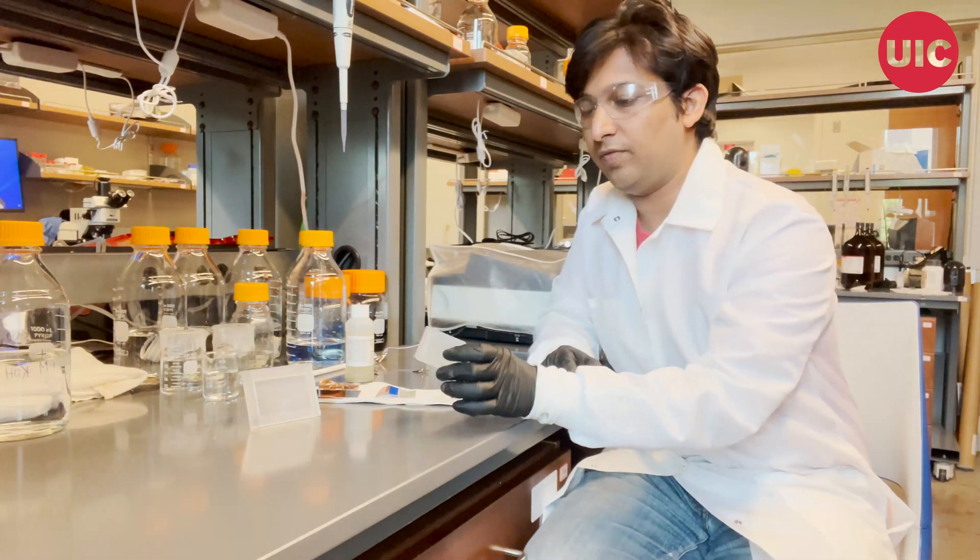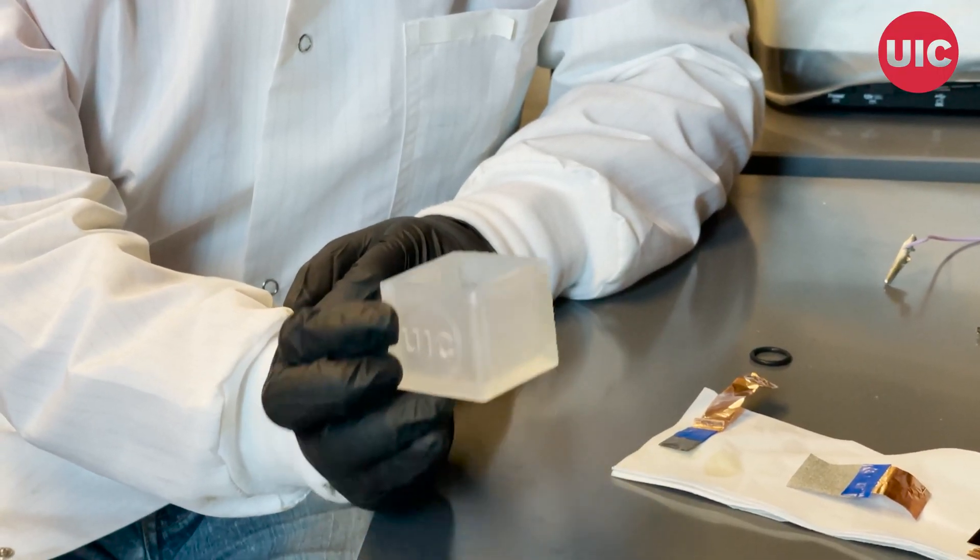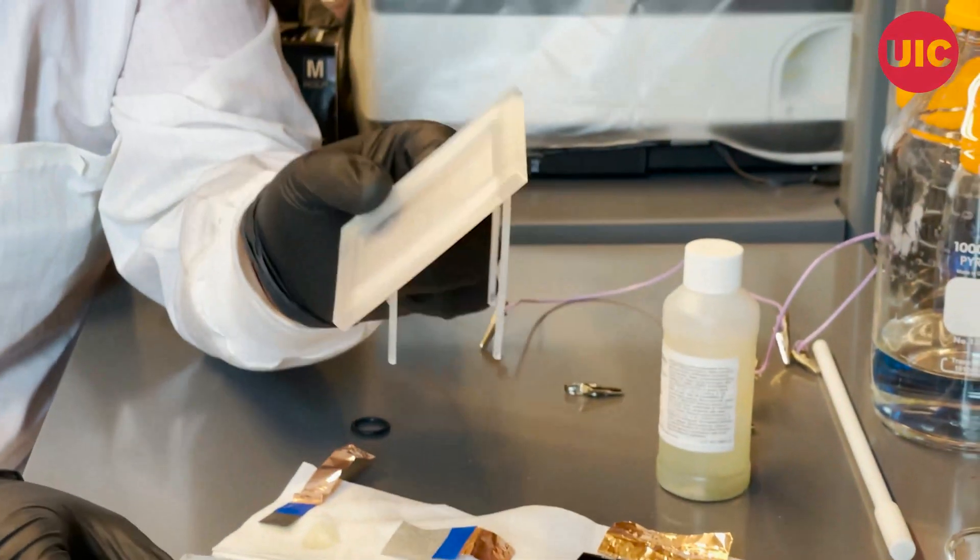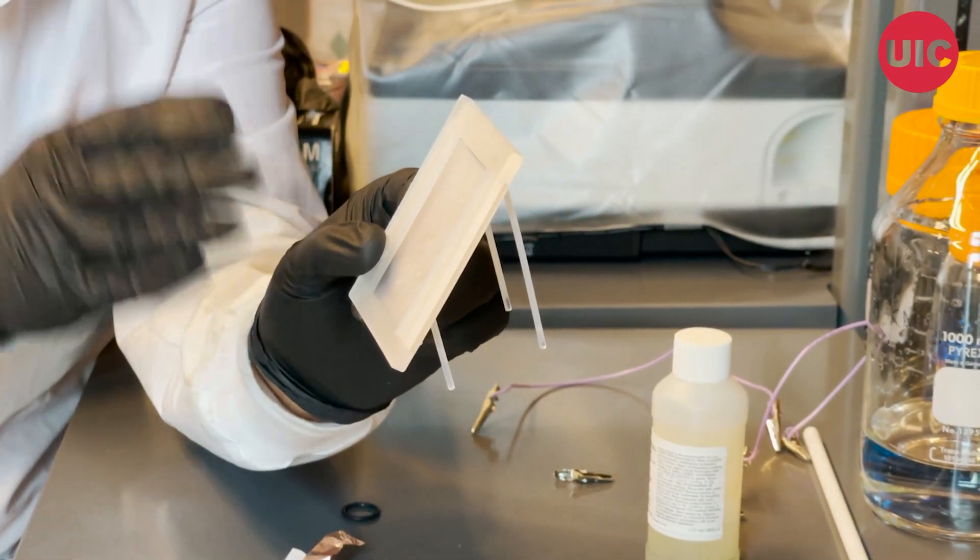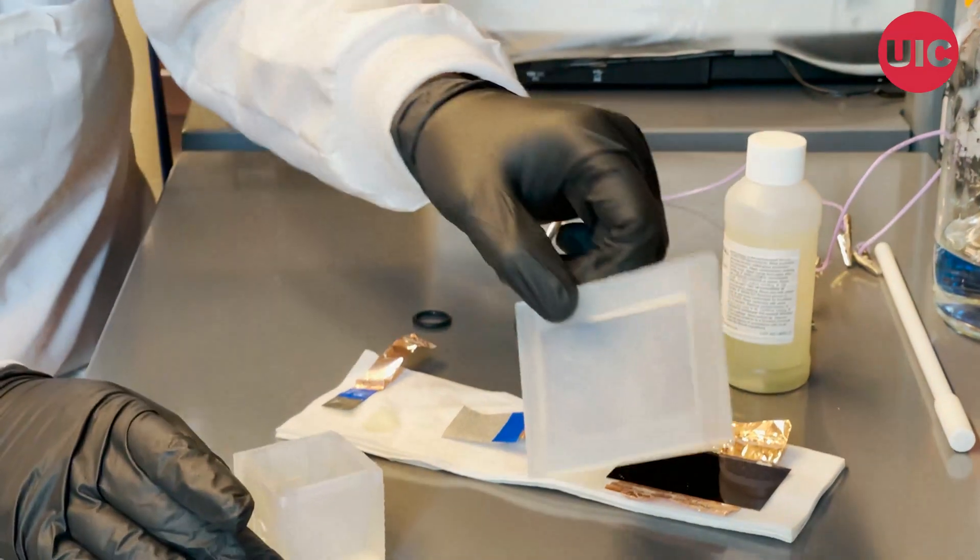We have this bottom part which is essentially our electrochemical cell where our electrodes and electrolyte will go in, and on top we have this case for our solar panel. We'll insert our solar panel in and then connect it through the cell so that we can do the electrochemical reaction.